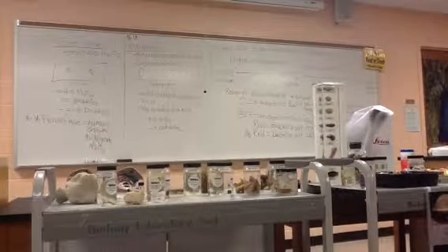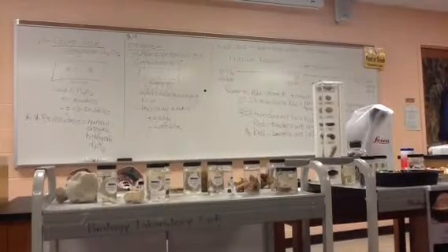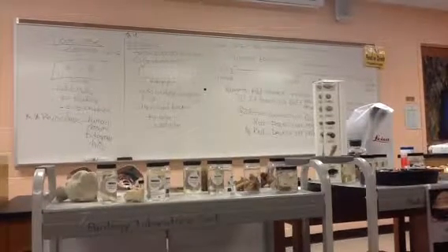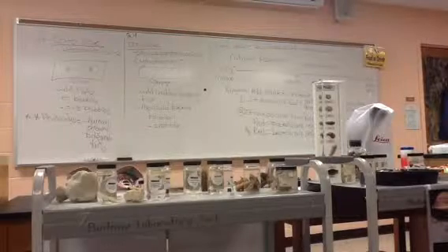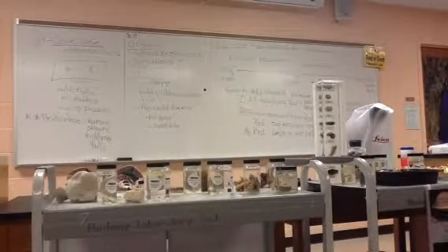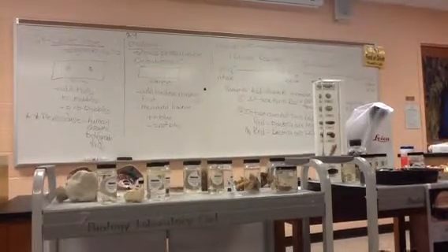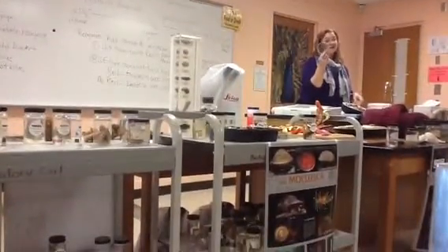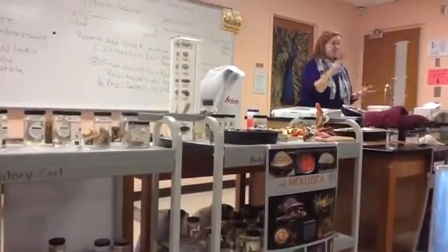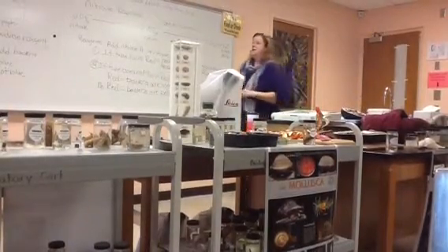Also, these have been in the incubator for longer than they should have since we had class canceled, and they're very, very stinky, particularly the green one. Pseudomonas aeruginosa is one of the smelliest bacteria that we work with. It smells like trash, old trash that's been sitting in the trash bag forever. So be ready to go and have this open for as little time as possible. It's not going to make you sick, it just smells really bad. So, fair warning. All right, so that's catalase. Any questions on that one?